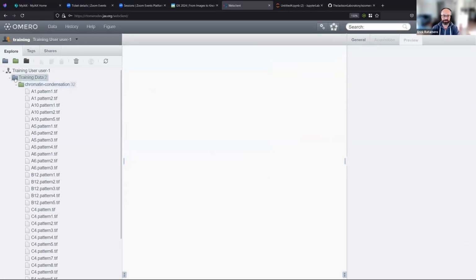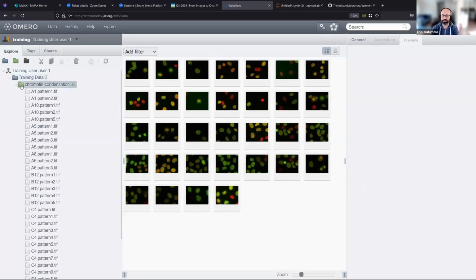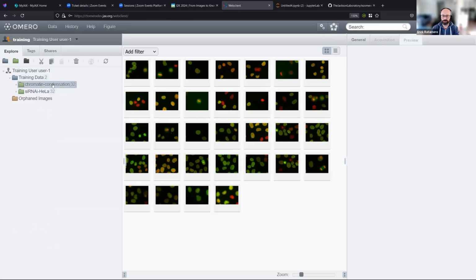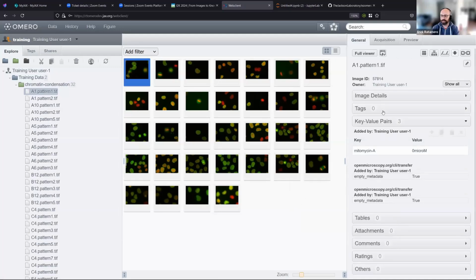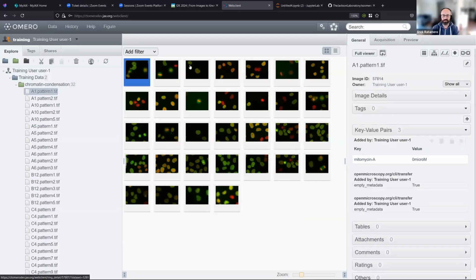It gives you projects, which are the blue ones, and it gives you data sets, which are the green ones. If you need any more organization on top of that, there are options like, for example, you can add tags to your images. So if you need any kind of subset of these images here, you can just add a tag to that subset.